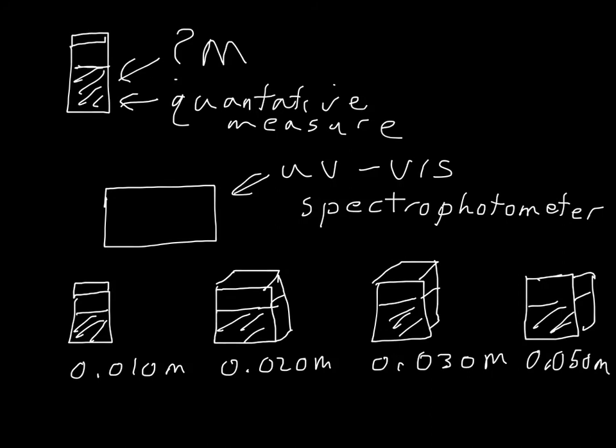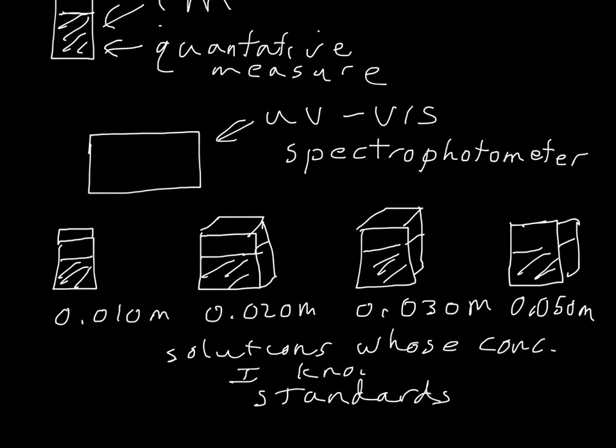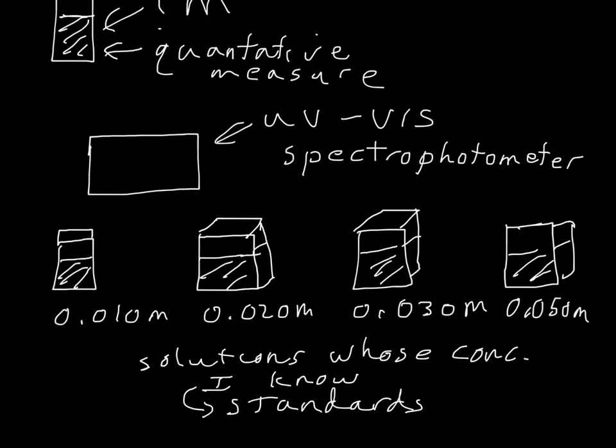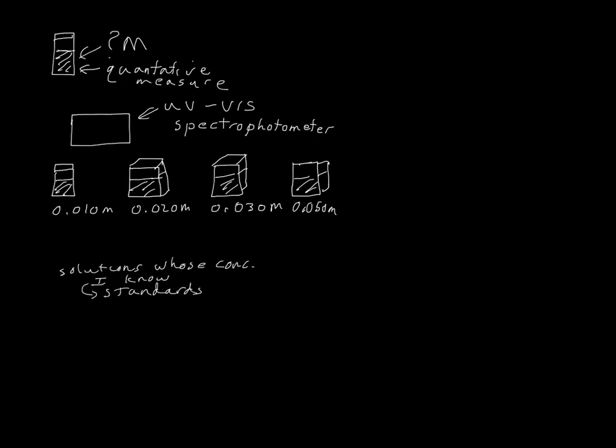In other words, these are what we, as chemists, refer to as standards. I would place these standards in my spectrophotometer and measure their absorbance.